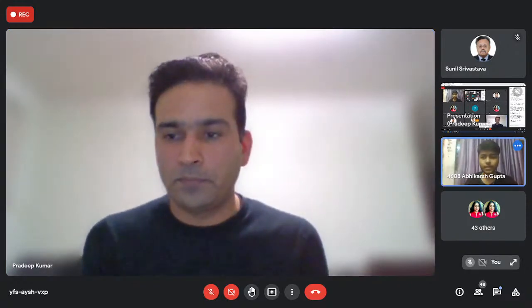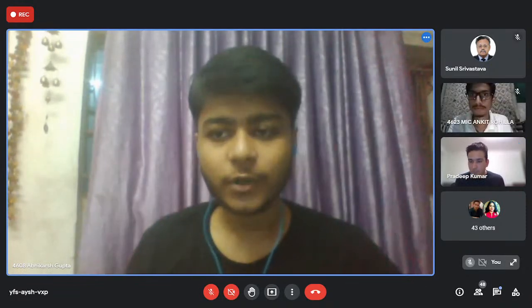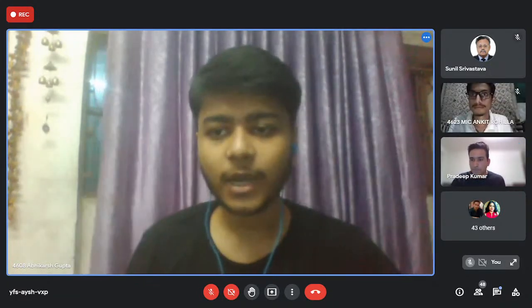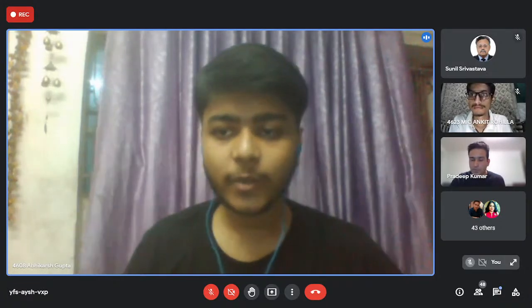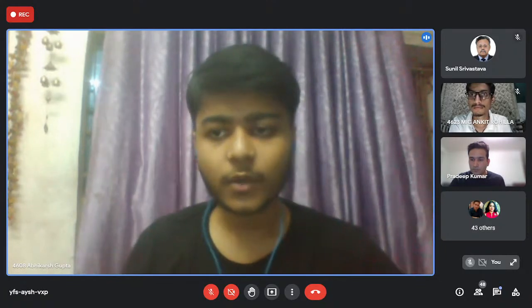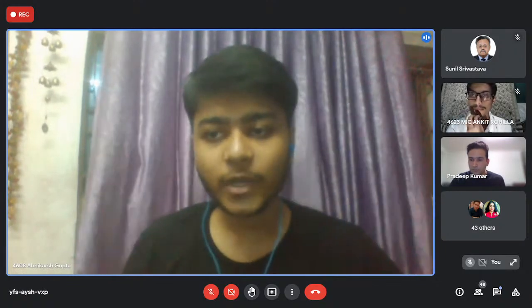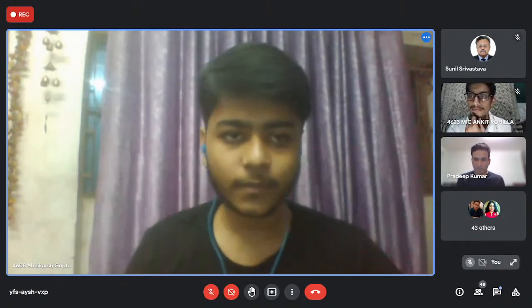Thank you, sir. Chitrali ma'am, we have taken one question from you. To give everybody a fair chance, I'll take questions from others first, and if time permits, we'll come back to your remaining questions. The next question is by Paramjit Bhaiya: sir, how can flow cytometry be helpful in studying different apoptotic stages?